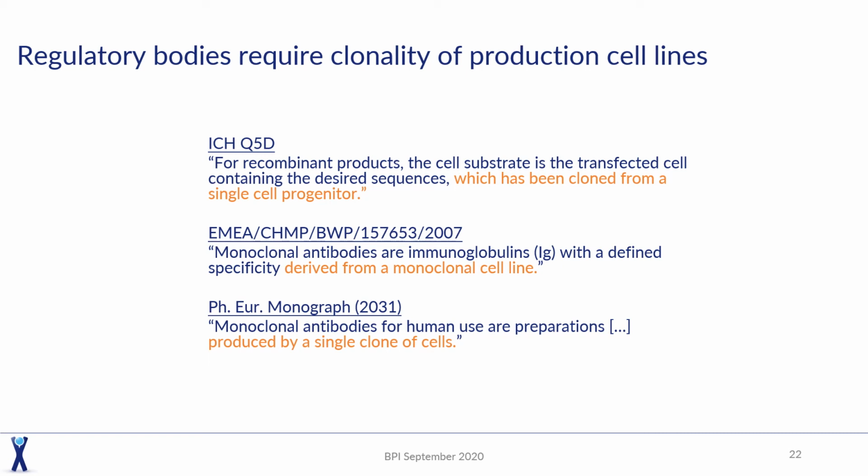And then one option, of course, is to do 2 rounds of limiting dilutions. But as you all know, that's very time costly. And of course, if you rederive your cell line, that might affect all your media formulations and importantly, the production. And so especially when you want to do your filing, time is of the essence.